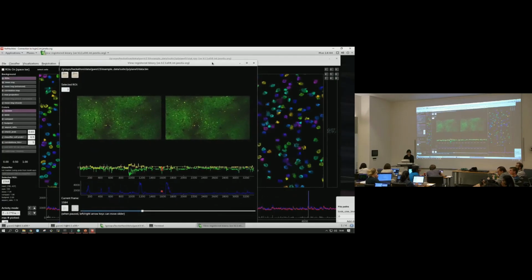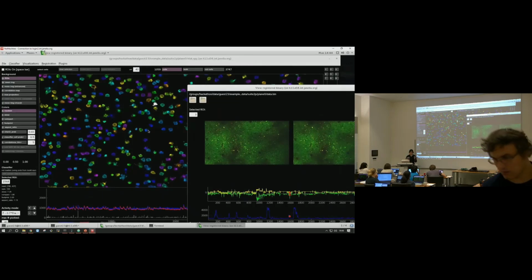So if you don't have any information about pixel size here, what is it using to automatically detect what it thinks is a cell? So when Marius talked about the correlation map and extracting these peaks, it extracts a bunch of these peaks, and the first 100 that it extracts is what it uses as the average size. So that's what the classifier says is the average size, and then it computes the normalized pixel number. So every cell has this normalized value, and it prefers ones that are closer to 1, closer to the size of the top correlated things you find.